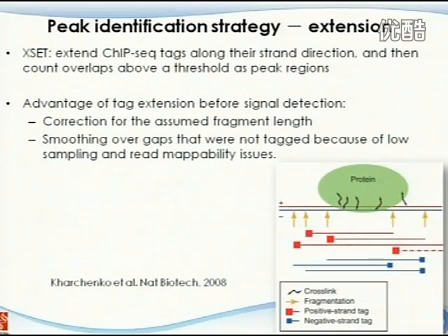So what happens is because of this short read feature, you may see some part that doesn't have any fragment at all if you don't do the extension. And then there are two interpretations for that. The first one is there's really no signal. But the second one is we just didn't sequence deep enough. If we did deep enough, we probably would get something.